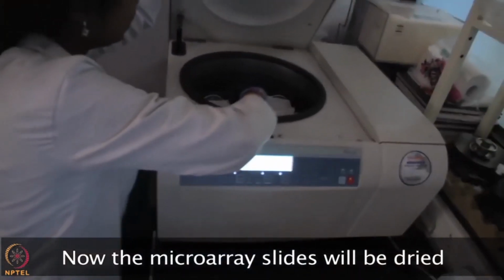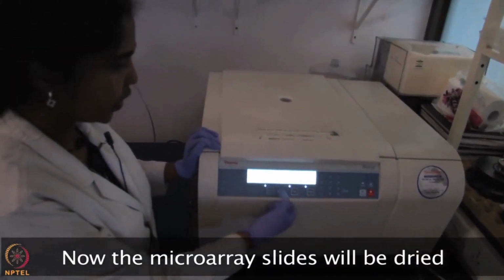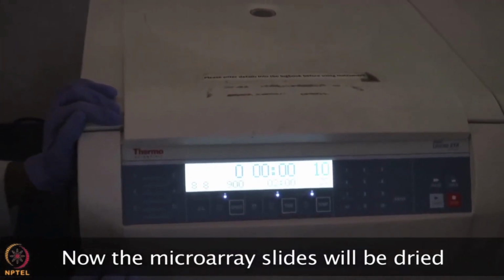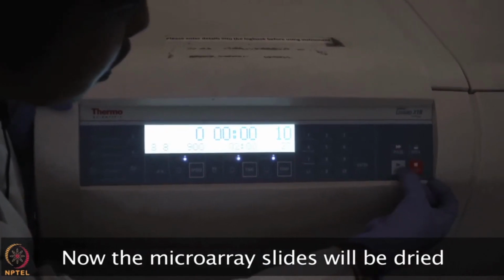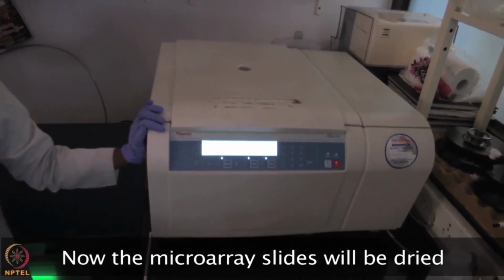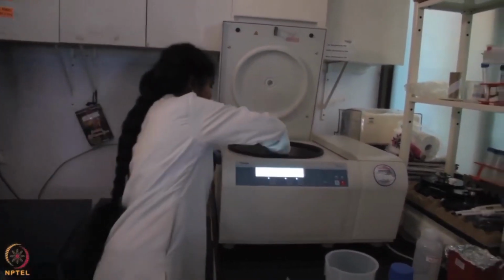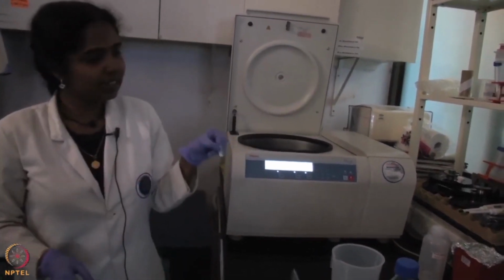So once you keep the slide, close the lid, and here the parameters are: speed is 900 rpm, time is 2 minutes, acceleration and deceleration is 8 and 8, and the temperature is room temperature. So once you keep the slides, then spin it. So just start the spinning. After centrifugation, now we are going to take out the slides. So you can see now the slide is completely dry.